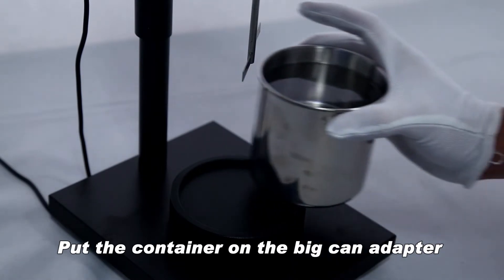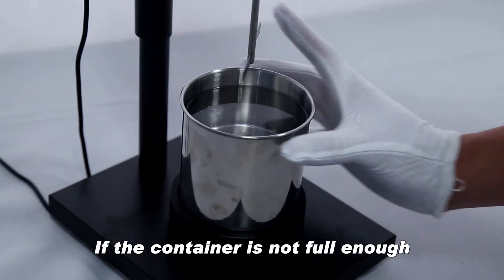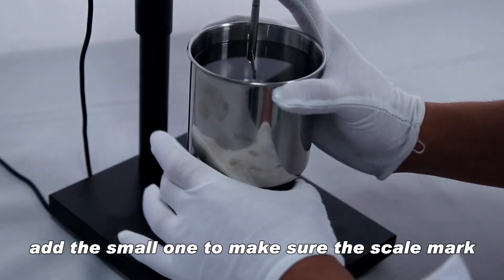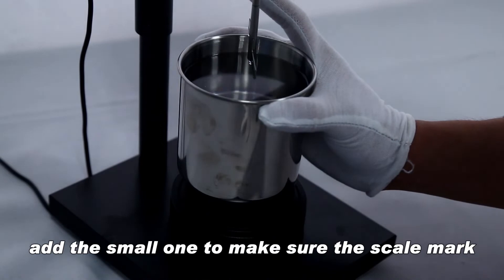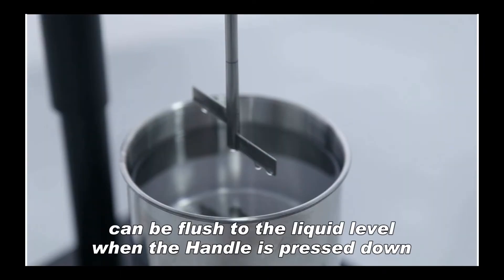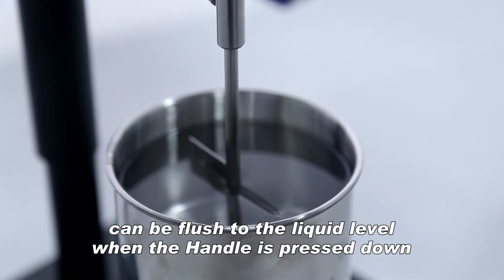Put the container on the big can adapter. If the container is not full enough, add the small one to make sure the scale mark can be flushed to the liquid level when the handle is pressed down.